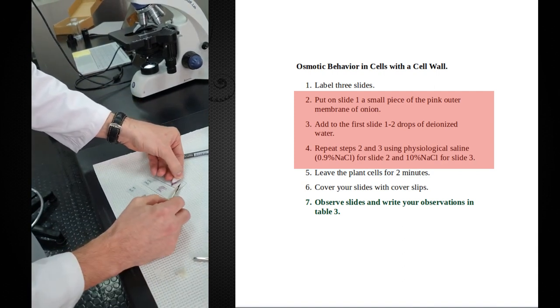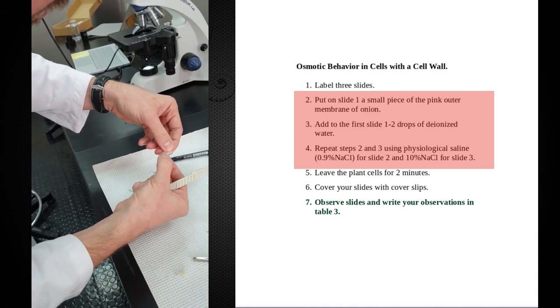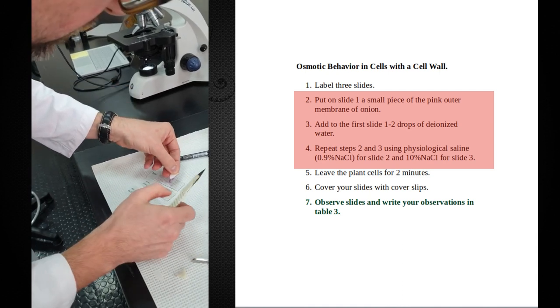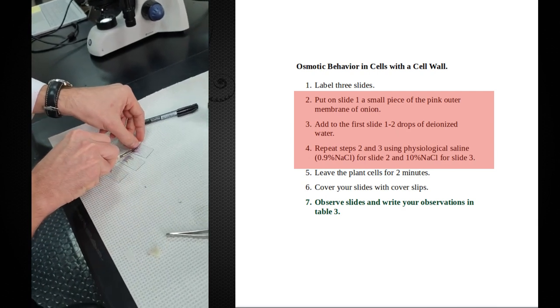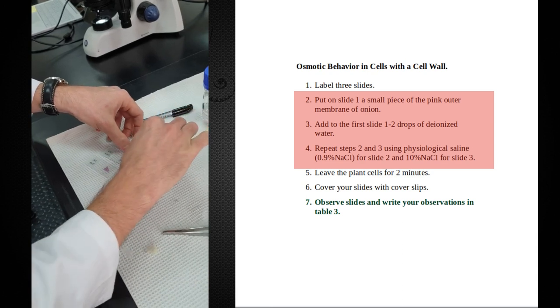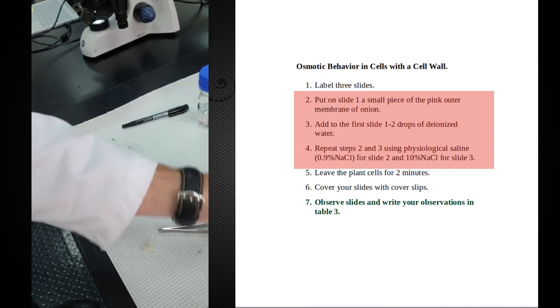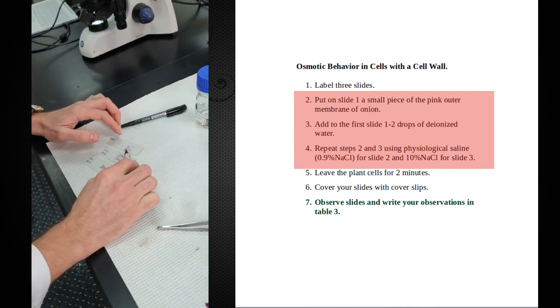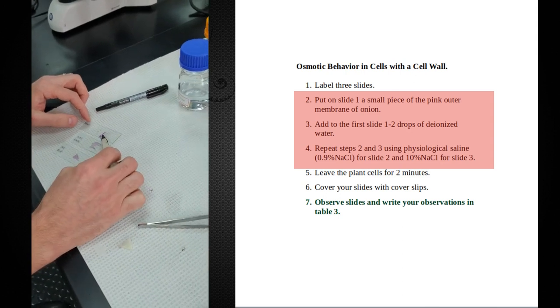Okay, so I'm going to fold it under itself. Again, it's really these red cells here that I want to look at.